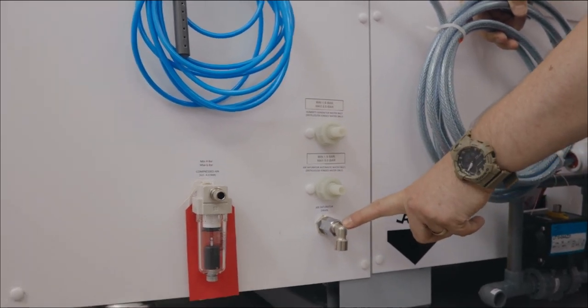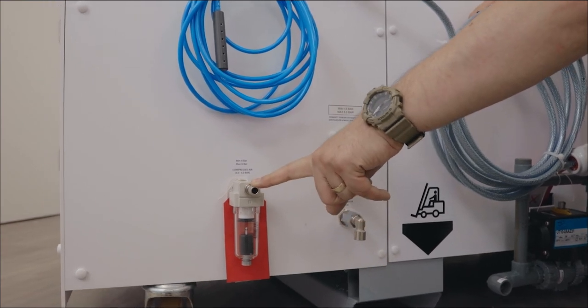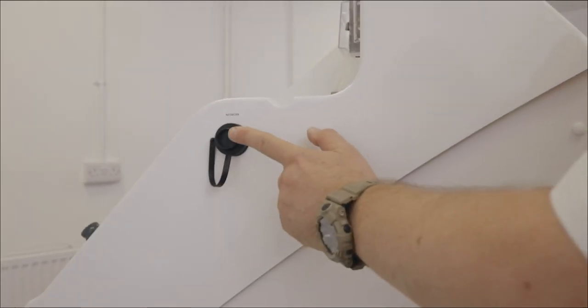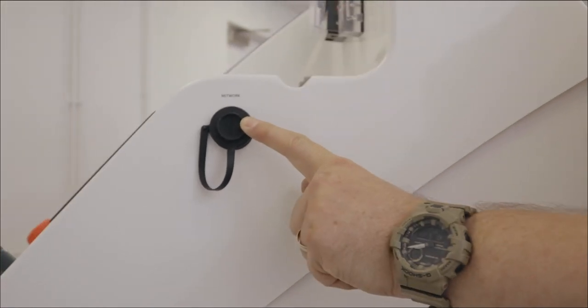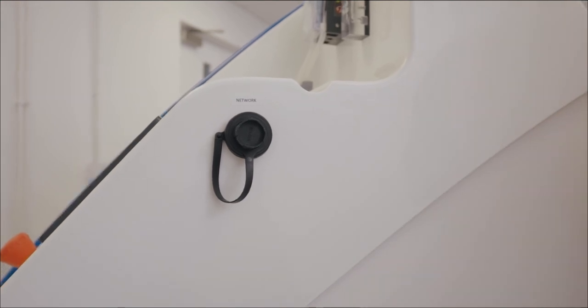We have the air saturator drain and to its left we have the compressed air inlet filter. On the right of the chamber we have ethernet socket for connection to the logging software.